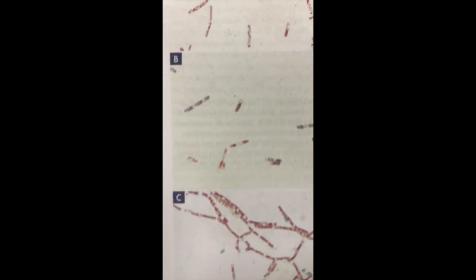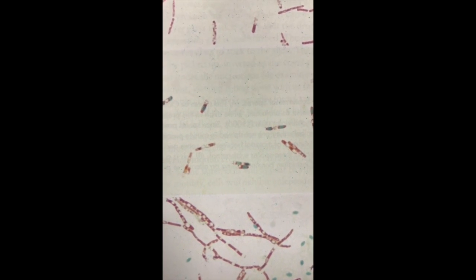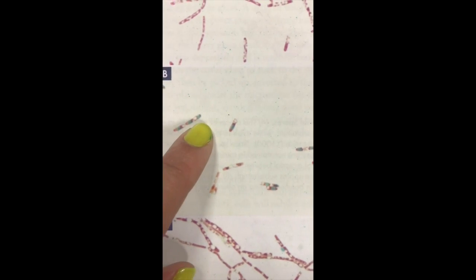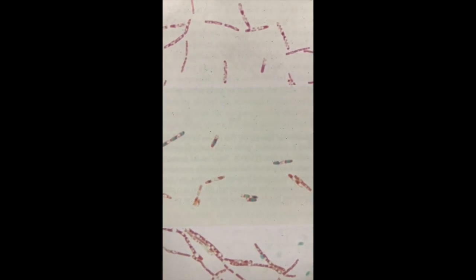And then we'll take a look at B. In this specimen, the spores are still within the mother cell, and that's why you see the green within the red vegetative cells.